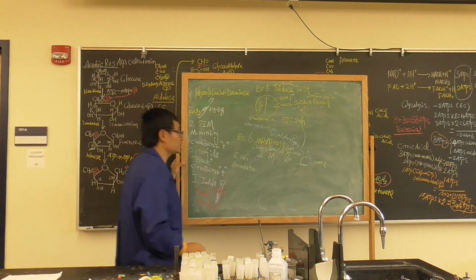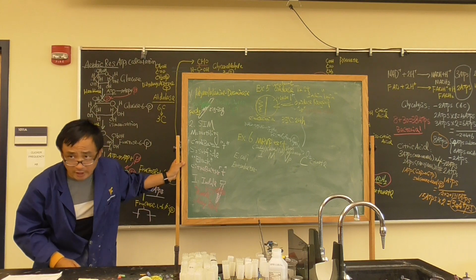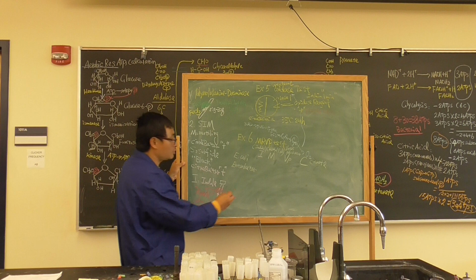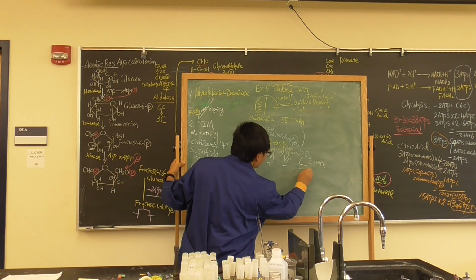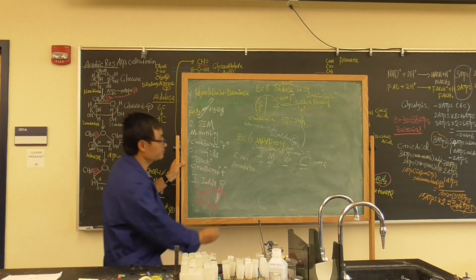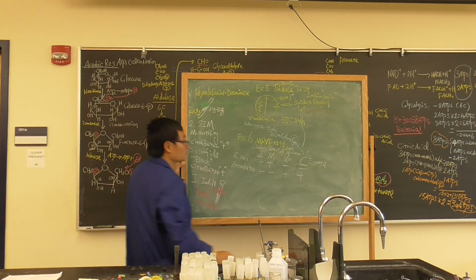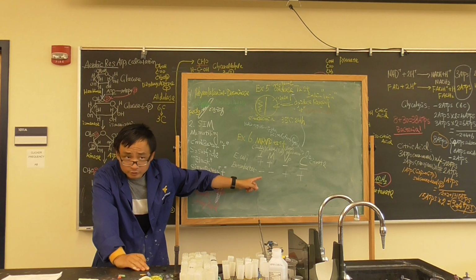Why is this test important? This test can differentiate E. coli and Enterobacter because the results are very interesting. E. coli is positive, positive, negative, negative. Enterobacter is negative, negative, positive, positive. What does this look like? Do you know DNA restriction enzymes?